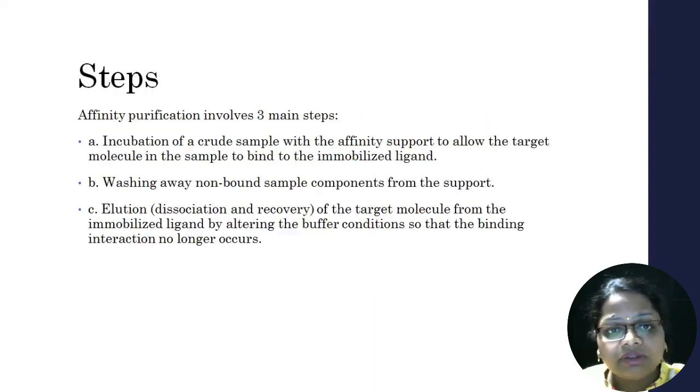Now, this technique has three main steps. First is the incubation of the crude sample, which is a mixture, with the affinity support, that is the matrix, to allow the target molecule in the sample to bind to the immobilized ligand. It means my target analyte will bind to the ligand in this step.